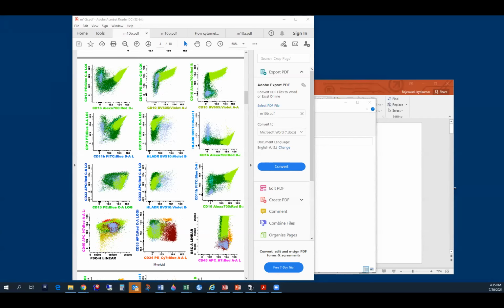4 is not, because when we actually gate, there will be some lymphocytes that you have to eliminate. So you will have to do reverse gating for that. But otherwise, there are a couple more things that can help: the bright intensity of HLA-DR and very bright CD33. These also help for gating purposes. Mm-hmm. Yeah. Thank you.